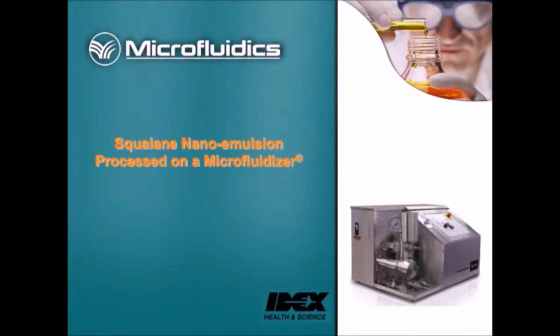Hello, welcome to Microfluidics. My name is Kyle Jandrasitz, and I am one of the applications research engineers here. Today we're going to talk about processing a Squalane Nano-emulsion through our Microfluidizer.